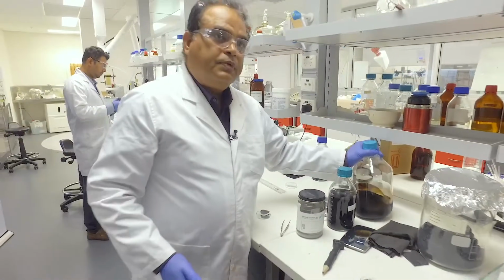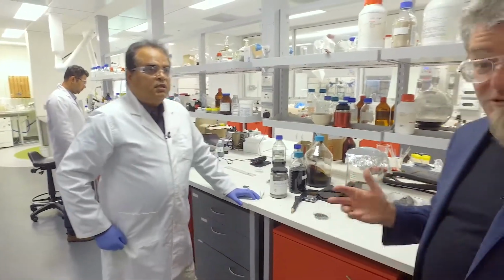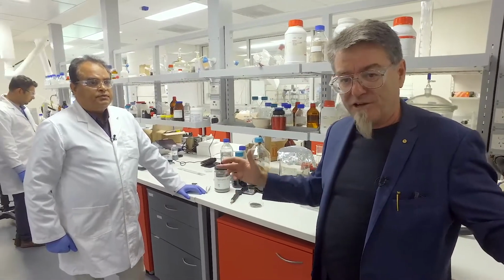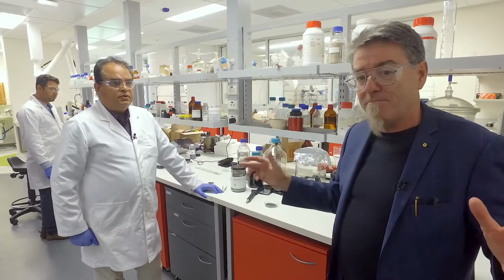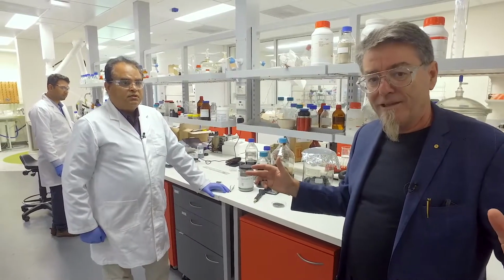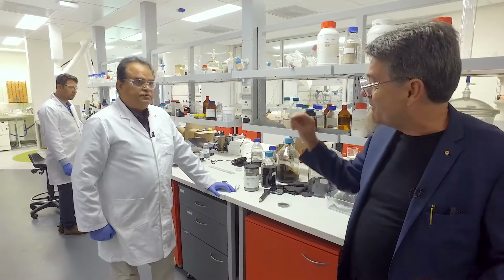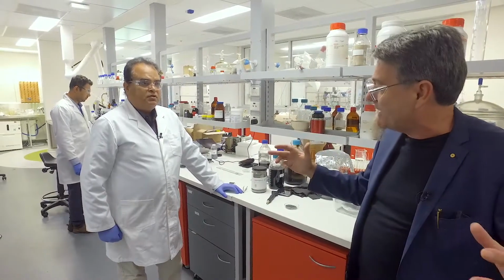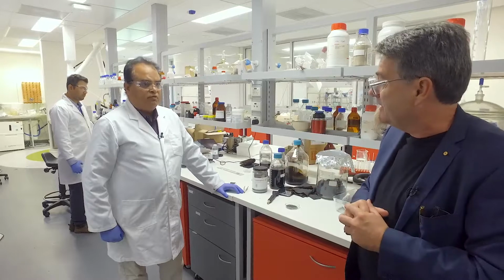So people might think, of course, that 70 micron is not particularly large. But it is. I mean, we're talking about a 70 micron sheet. That's a bit bigger than the diameter of a human hair. But remember, we're talking about a material that's 1 or 2 carbon atoms thick, right? Yeah. And so the aspect ratio of that is huge. Absolutely, very, very huge. Yeah.